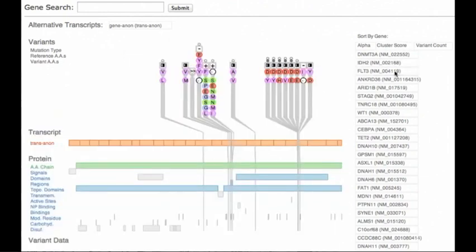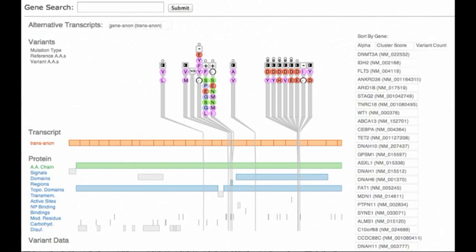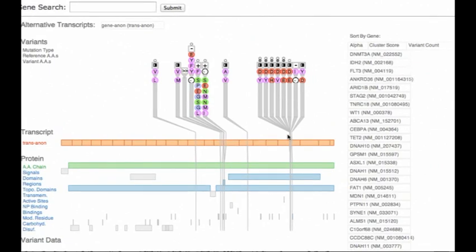Including DNMT3A, FLT3, and IDH2. We quickly confirm that these genes are problematic because we see many hotspots of variants close to each other in each of them.